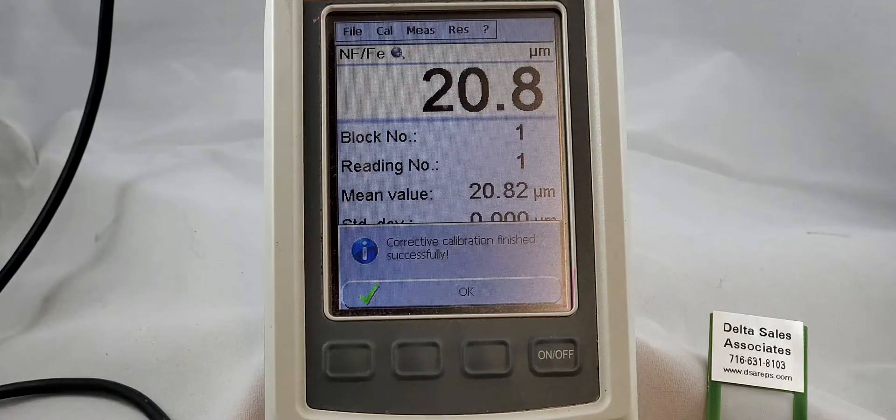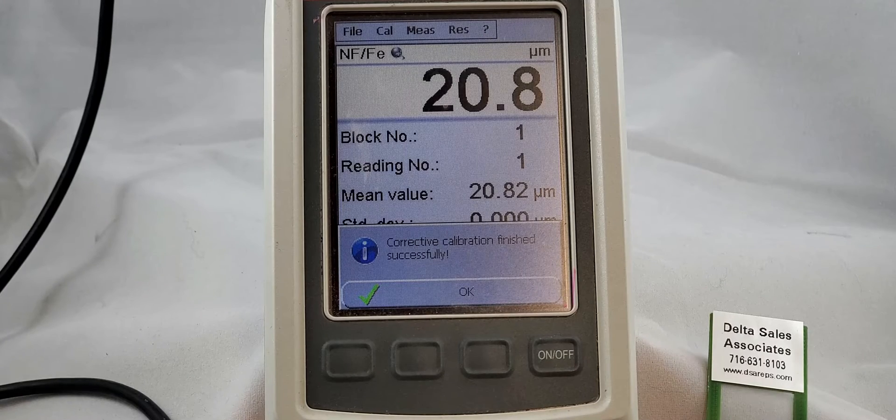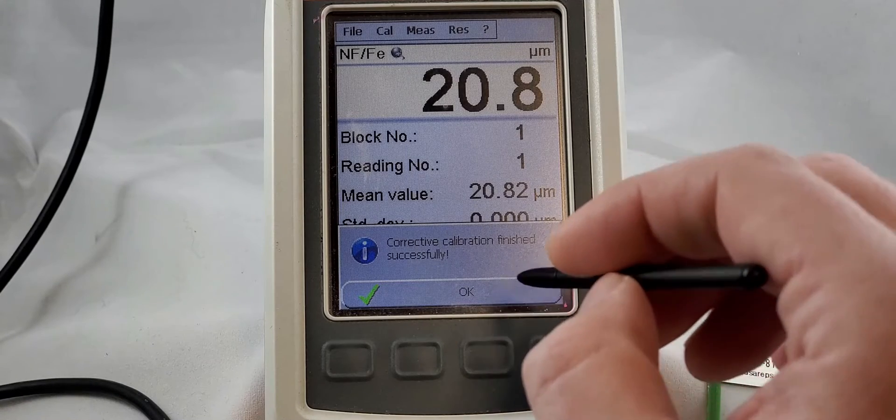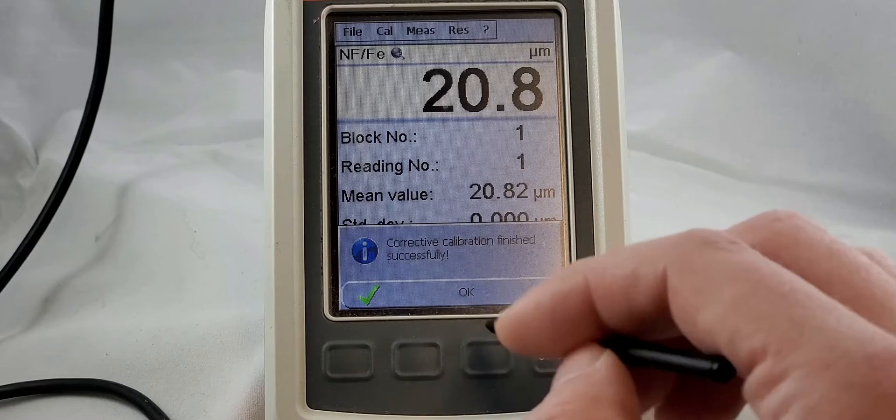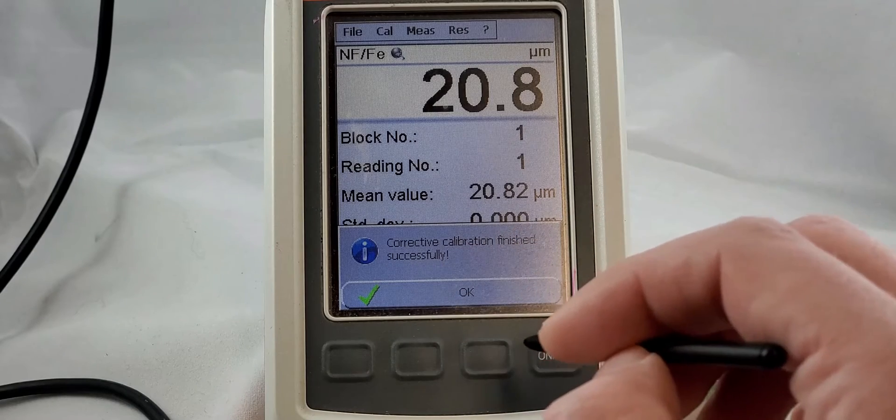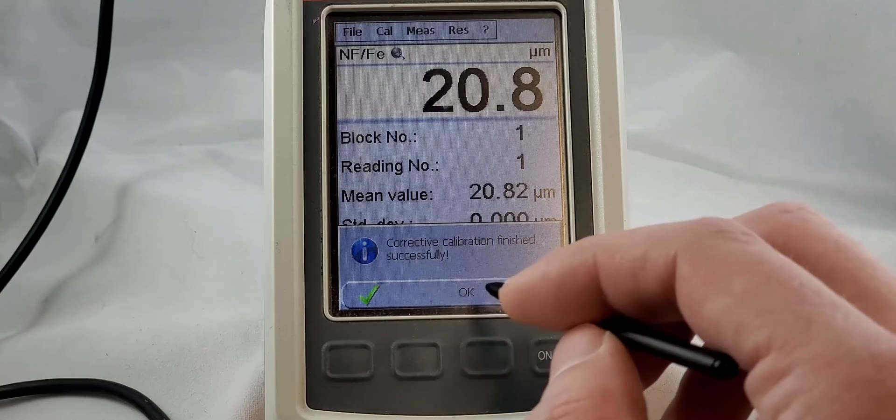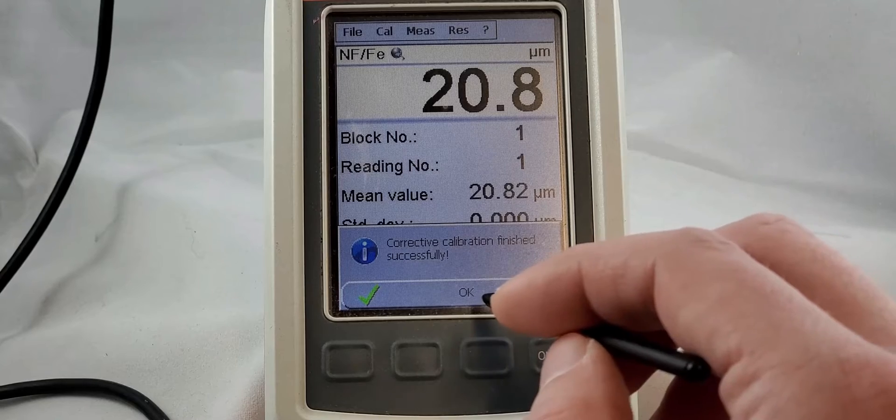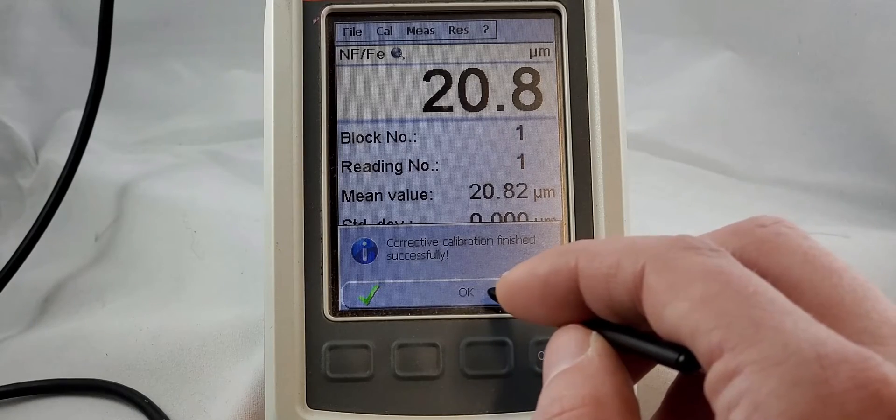If you see that message, you're done. And that's a good thing. If for some strange reason something went wrong in the calibration, it would tell you the step that you need to repeat. Repeat that step and you should be okay.